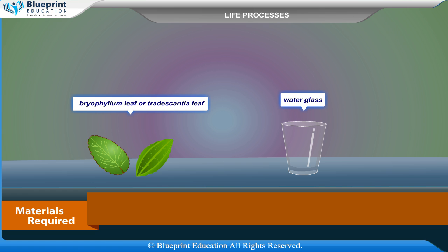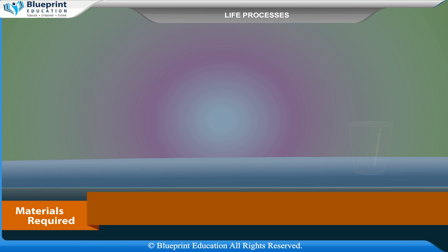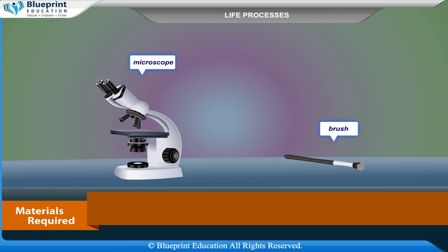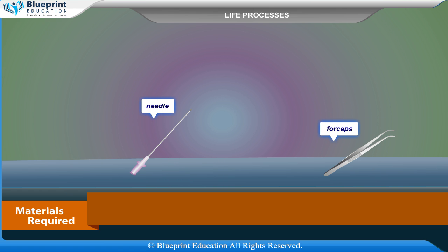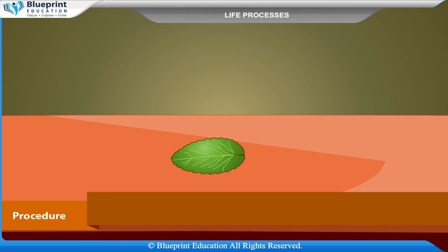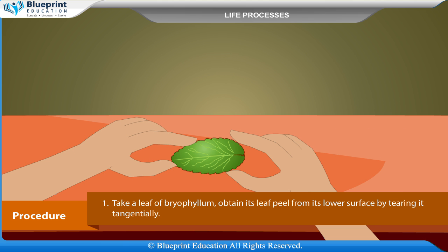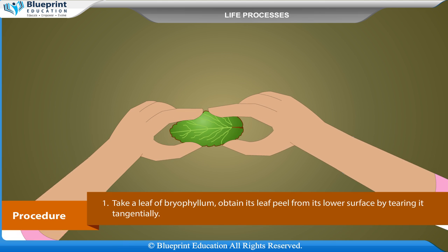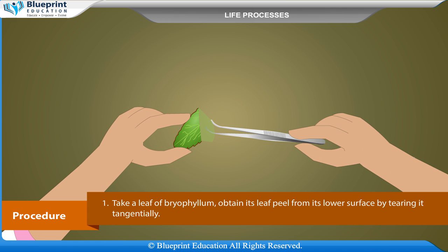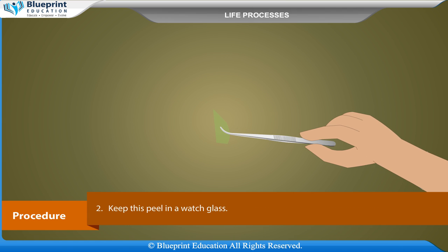Procedure: Take a leaf of bryophyllum and obtain its leaf peel from its lower surface by tearing it tangentially. Keep this peel in a watch glass.